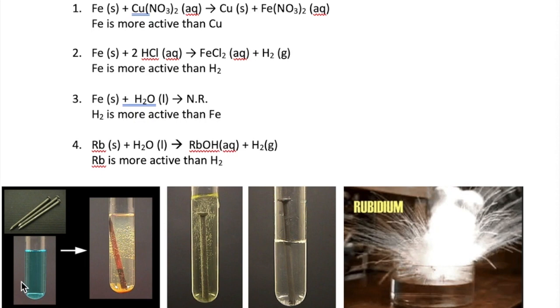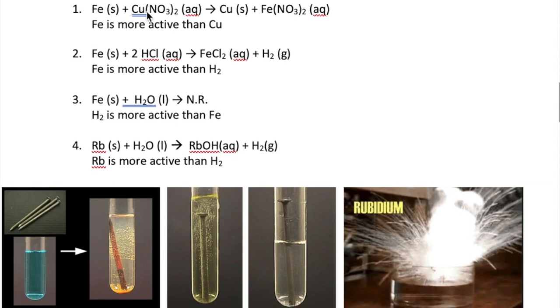Here are some examples. If we mix iron metal with a copper nitrate solution, we observe the following. Notice the change in color in the iron nail, indicating a reaction. The bubbles that you see stuck on the side of the test tube wall is not a product, but merely a sign that the reaction releases heat, which warms the water in the solution. An actual gas product will produce continuous bubbling. This reaction can be written as shown here, with iron oxidized and copper 2+ reduced to copper metal. This indicates that iron is more active than copper.